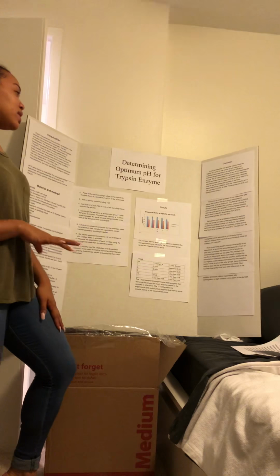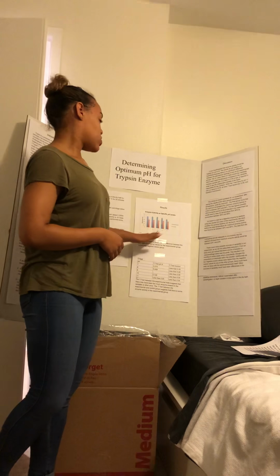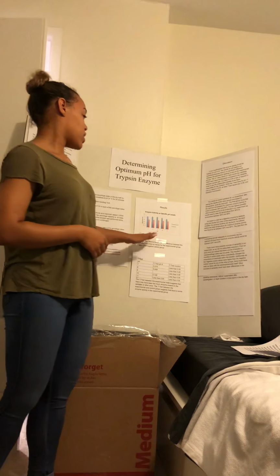Although our results weren't as promising or weren't what we expected or wanted, the Love group also tested pH, and their results clearly showed that there was an optimum between 7 and 9. So we were around that range. Some of that variability could have been too much enzyme, the way we were pipetting, and maybe pipetting in other areas of the experiment. Maybe some of our values and levels were different in each of the samples. That would have been a huge issue.